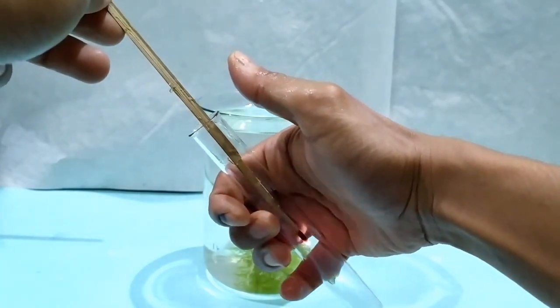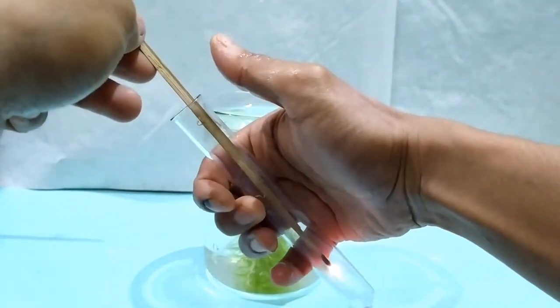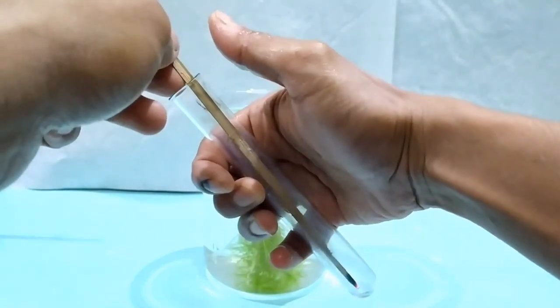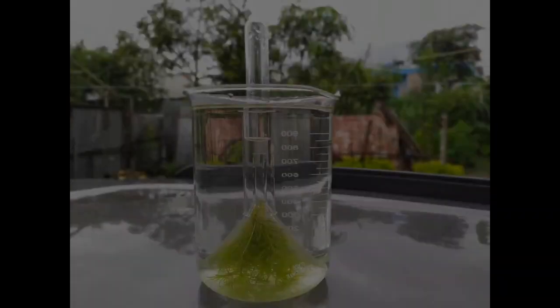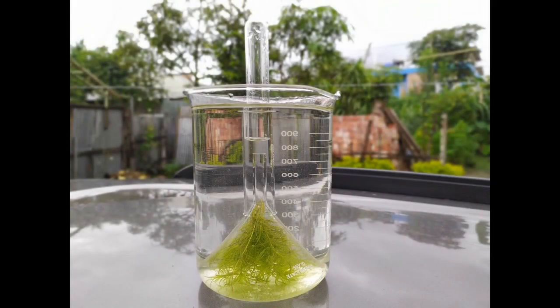This test confirms that the gas produced by the aquatic plant and collected in the test tube is indeed oxygen. This simple experiment thus demonstrates that oxygen is evolved during photosynthesis in green plants.